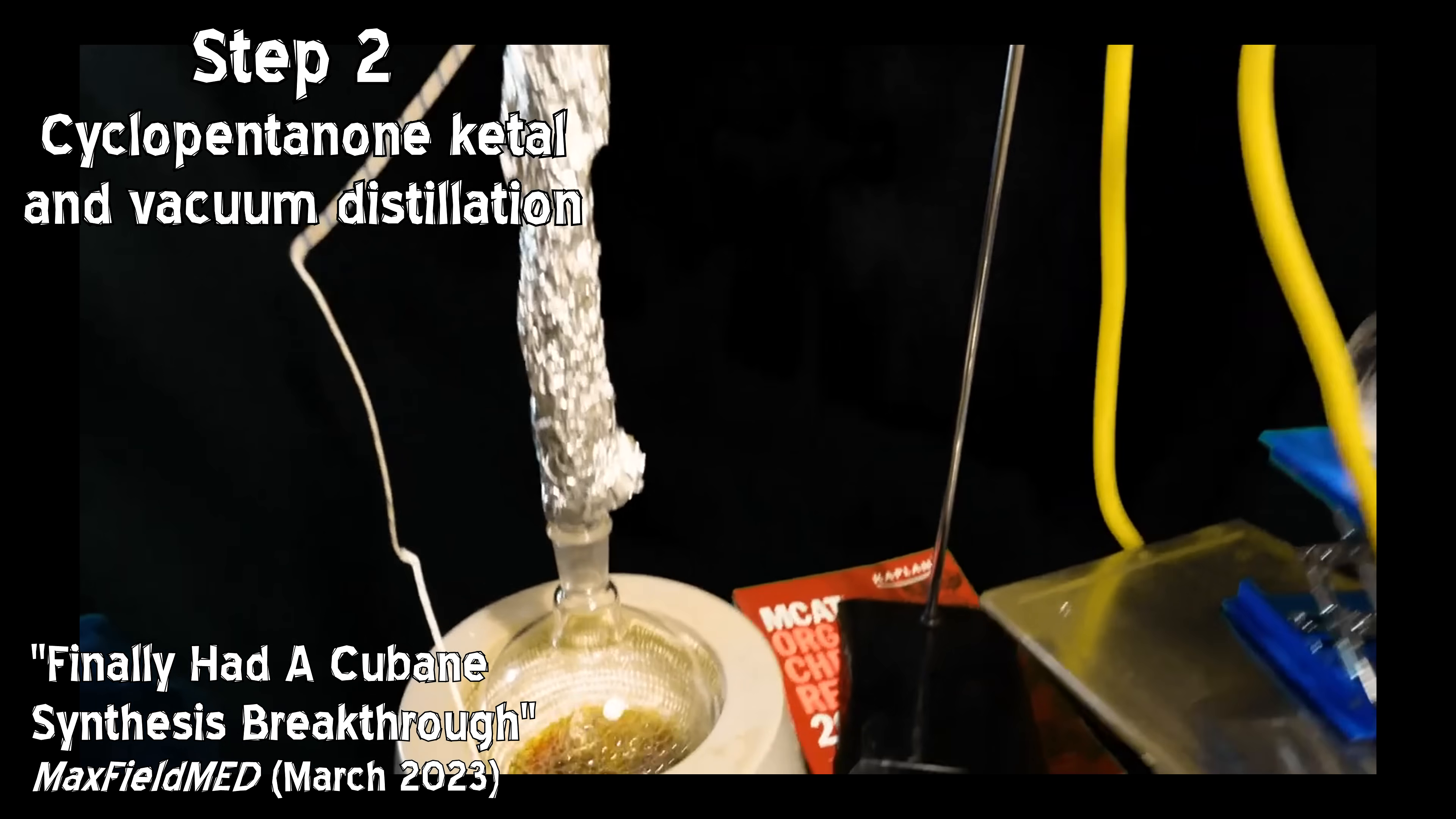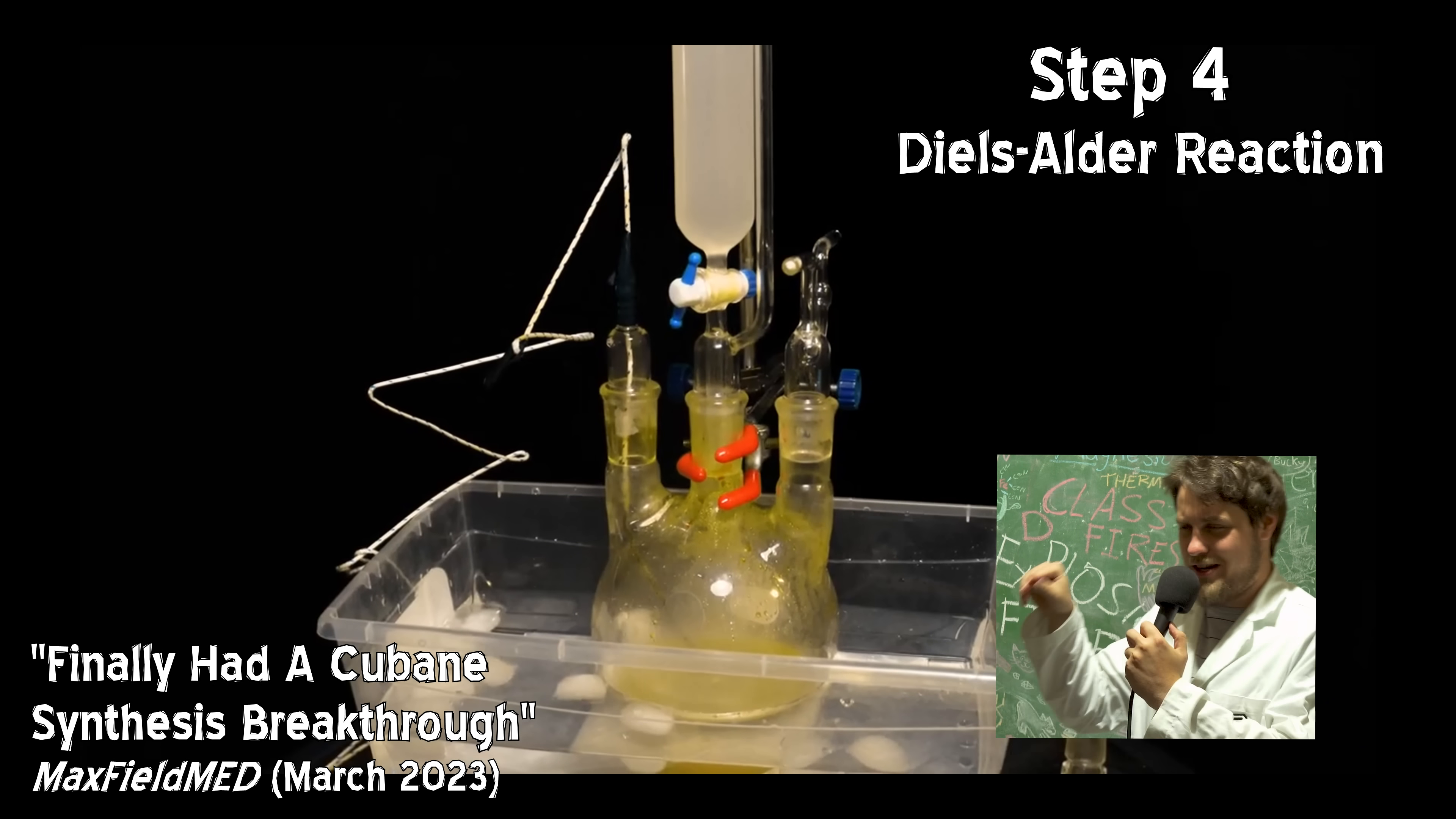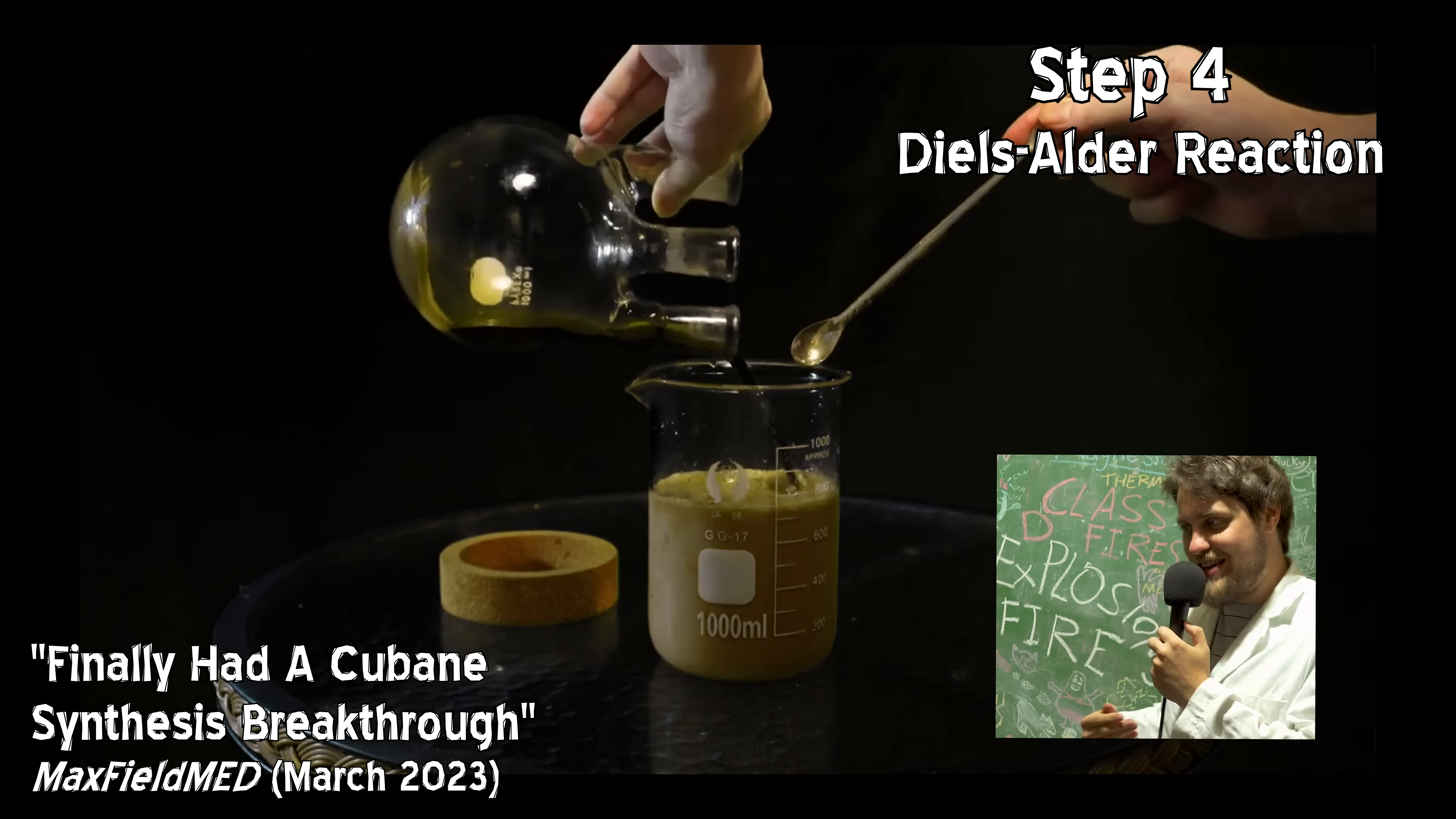There's two things I want to highlight in his experiments that I think are really cool. The first one is he's kind of crushing two steps together into one step. Rather than doing the bromination and then isolating the brominated product and then doing the Diels-Alder reaction, he's just doing it all in one pot without isolating the intermediate and it is working for him now. I think he had some trouble with the purity of the dioxane. I thought that was really cool. And it's something I might try next work through of all the steps.